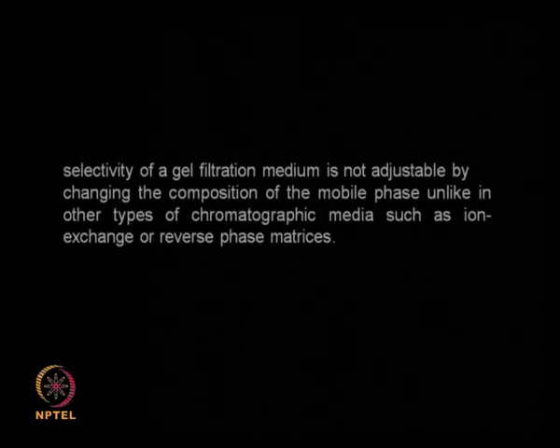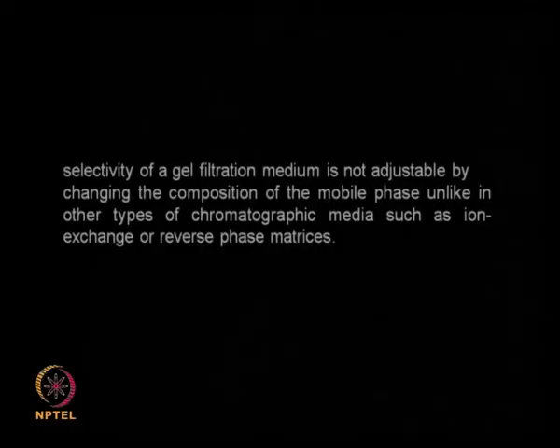Same thing with reverse phase, I can change the hydrophobicity of the solvent carrier medium, and by changing that I can enhance the interaction between the solute and the stationary phase, or I can reduce the interaction. Whereas in gel filtration we cannot do that, because gel filtration is based only on the size, it is almost like your normal filter medium, okay.